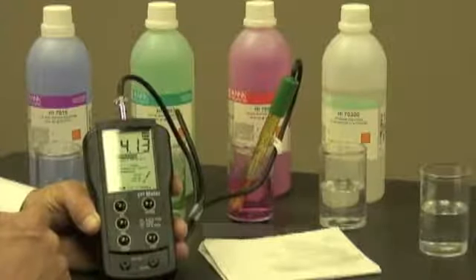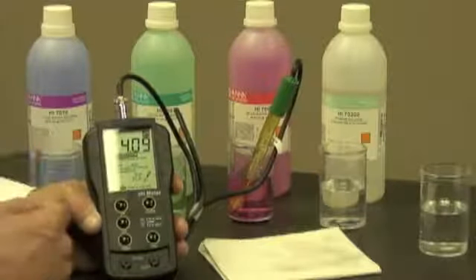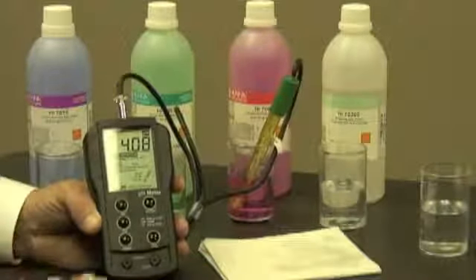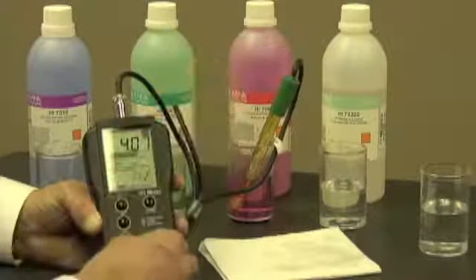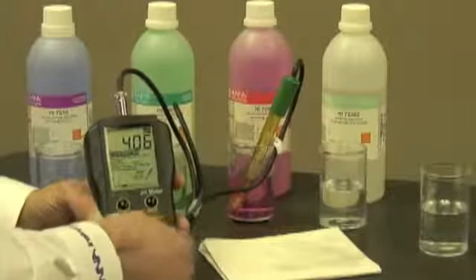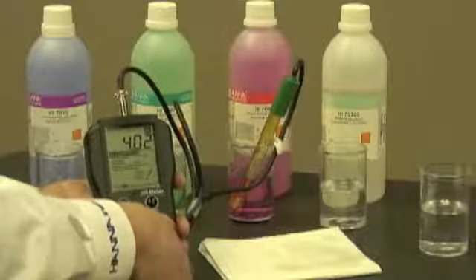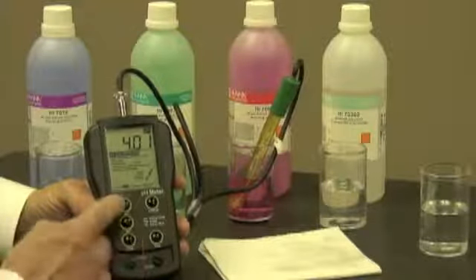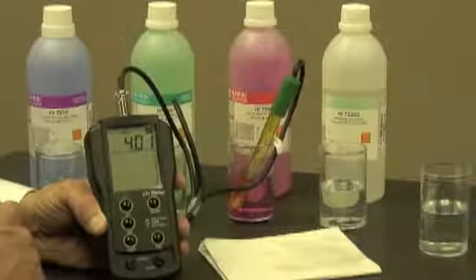I'll let it adjust. As you can see, the numbers are moving — now it's at 4.09, 4.10, hovering around those numbers. So I think it's time for me to make the adjustment, which I'm going to do by using my coin and adjusting the slope trimmer down to 4.01. Now I'm at 4.01. I simply push the cal button and my meter is ready to use.